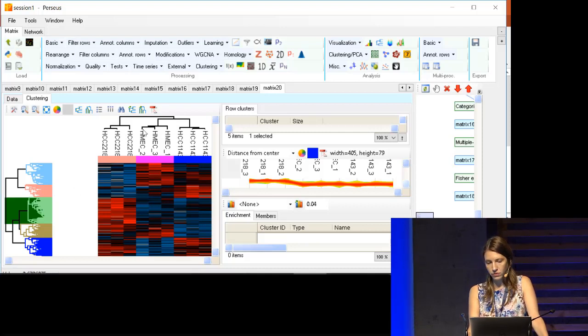I think if you just want to have the whole thing, just imagine, if you have 4,000 of these, what kind of font would you need to have to place it on an A4 paper? Sure, but I think the cutoff is already at 100 or so. I think with 100 it should work.